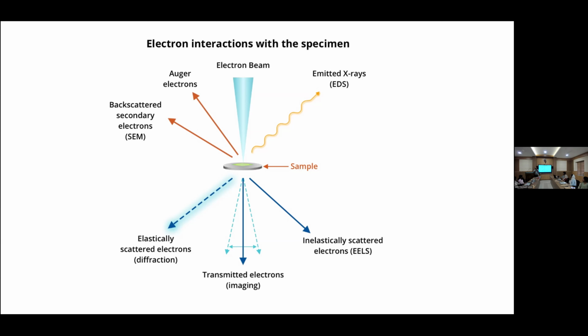So they are using X-ray sensitive films, and wherever X-rays reach, it becomes dark. So we are getting our skeleton image. That is how X-ray works. The same principle is happening in electron microscopy, transmission electron microscopy. We are getting a shadow image.